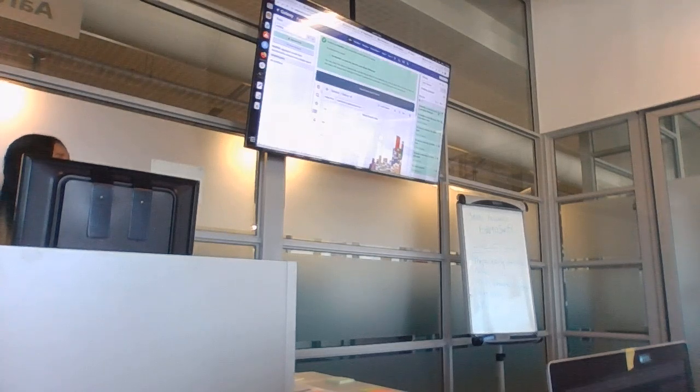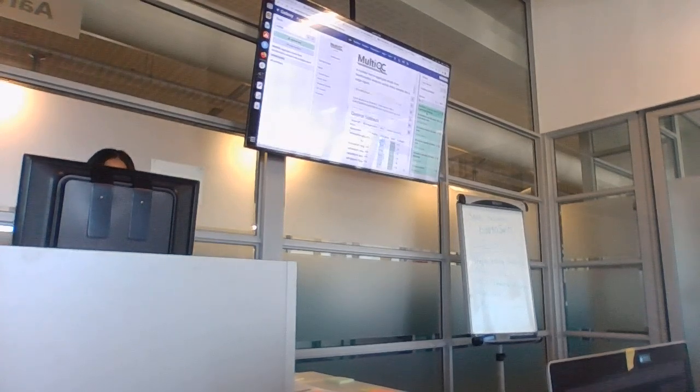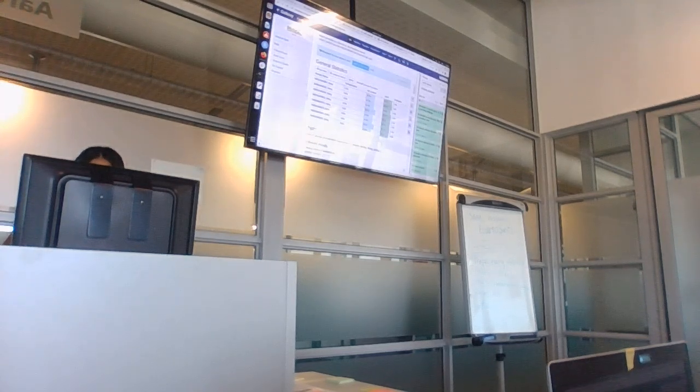Okay, so open this file and tell me, can anybody tell me what you're noticing? So I'm going to click because you guys don't want to answer. Does anybody have it open yet? Or is it slow? It's okay. Okay. Right. I'm going to open this up.